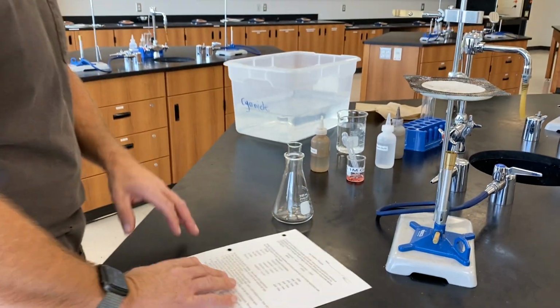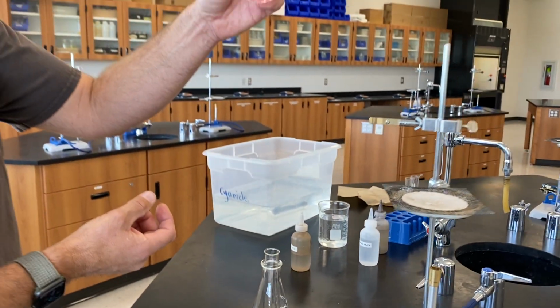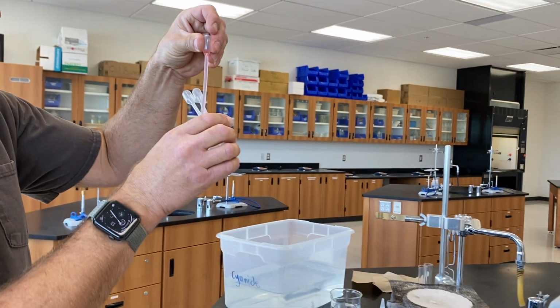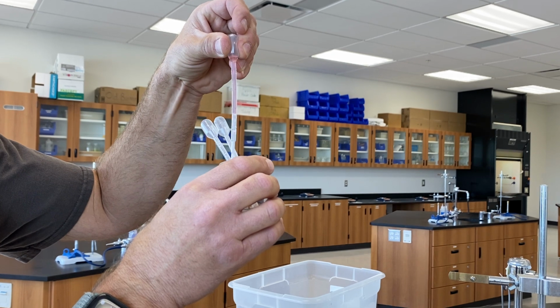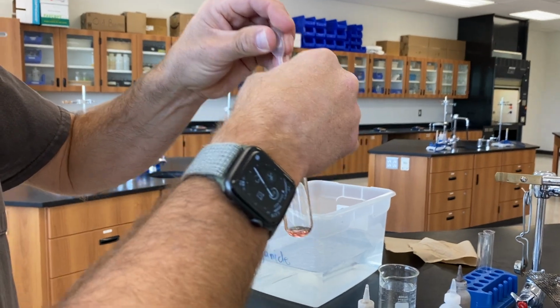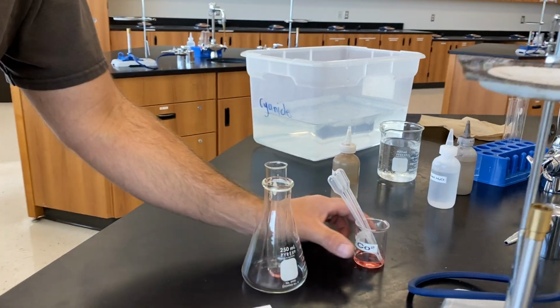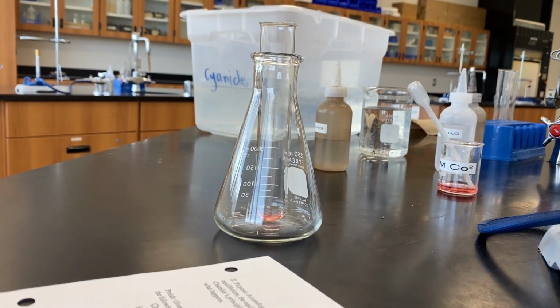Assuming that you are ready to go, we're going to go ahead and start the lab. In order to do that, step one, we're going to get 1 milliliter of this clear pink cobalt ion solution. To do that, we'll draw up the cobalt solution to the top graduation on this dropper, which is 1 milliliter. And then we'll transfer that 1 milliliter of pink solution to our test tube. And then step 3, we will place that test tube in our Erlenmeyer flask. Don't forget step 2 to go and record the color.